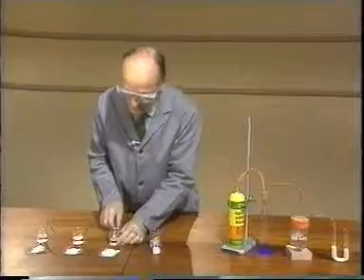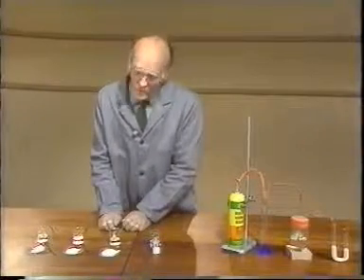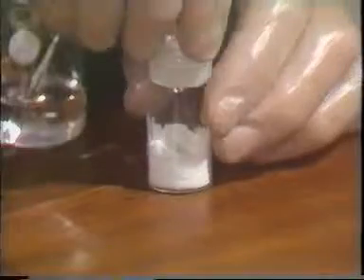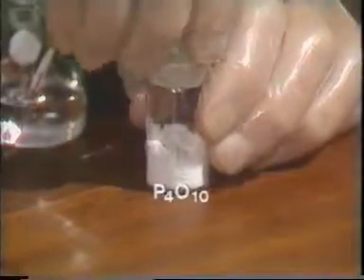So this compound dissolves neither in water nor in hexane. Now I'll try phosphorus pentoxide.